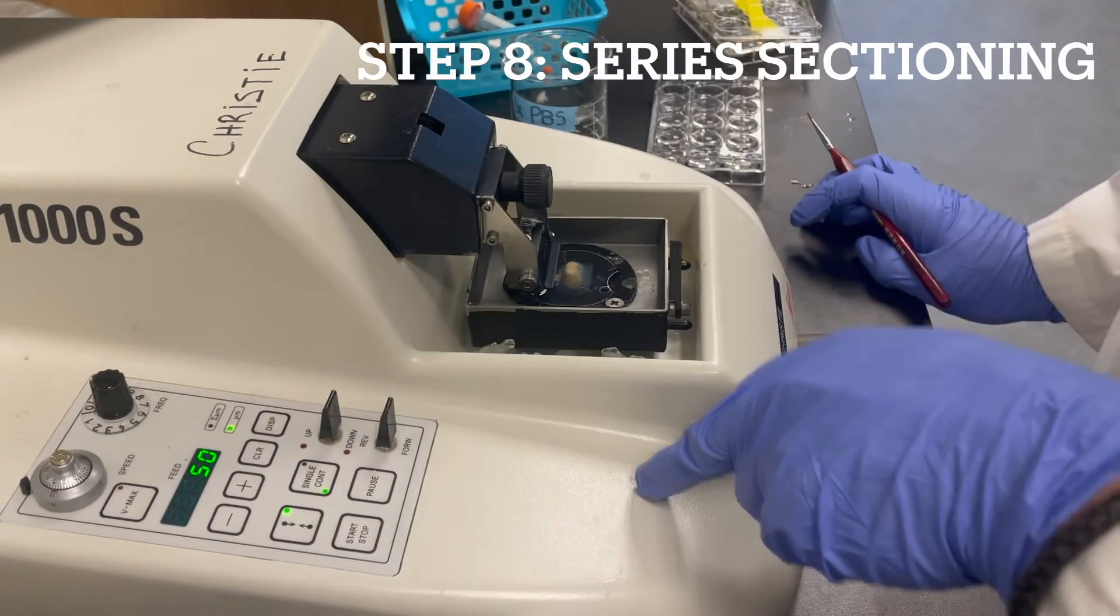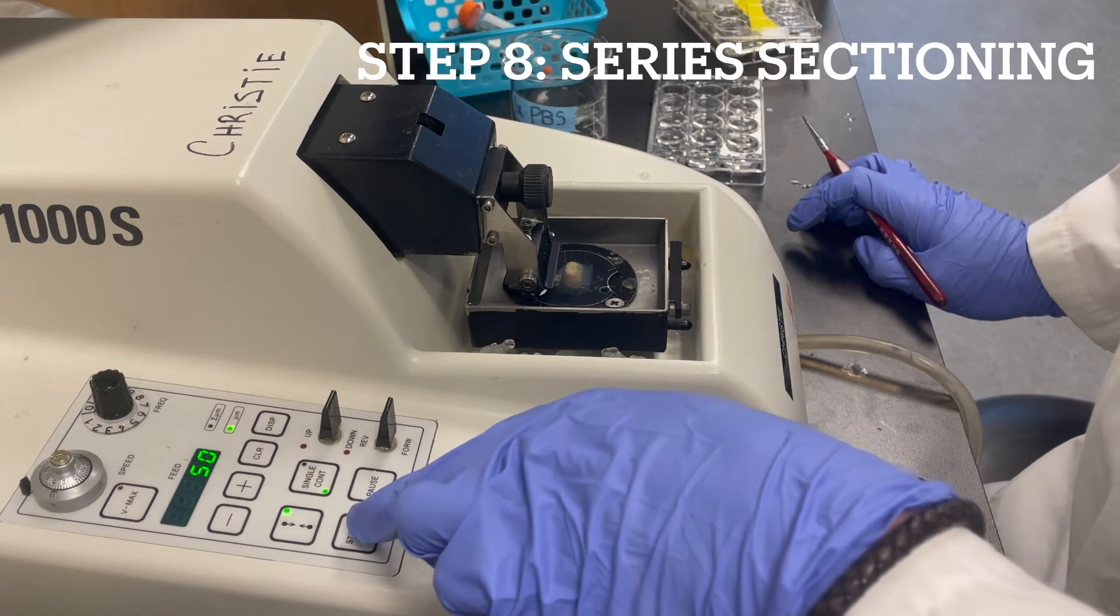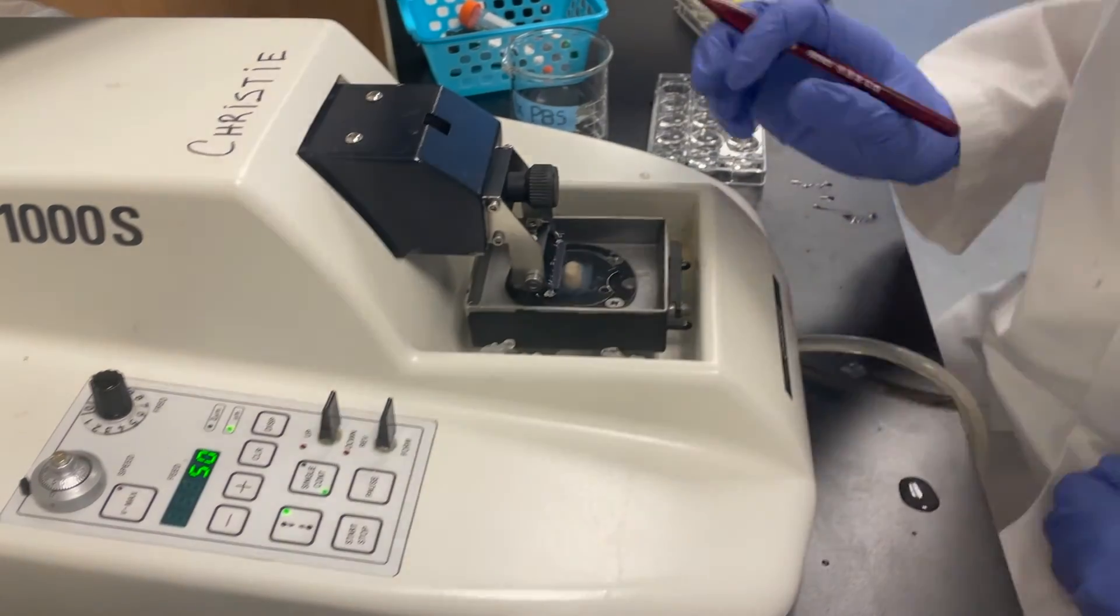Now once the machine is set, we will fill the tray full with cold 1xPBS, surround the tray with ice, and press start.